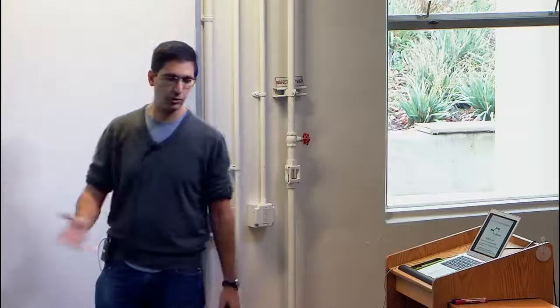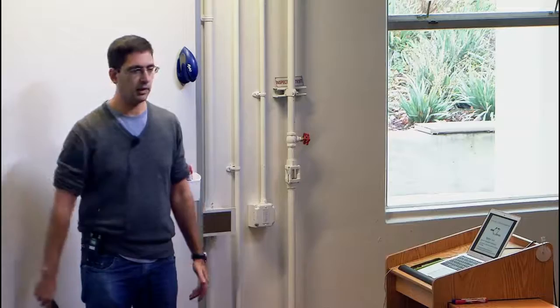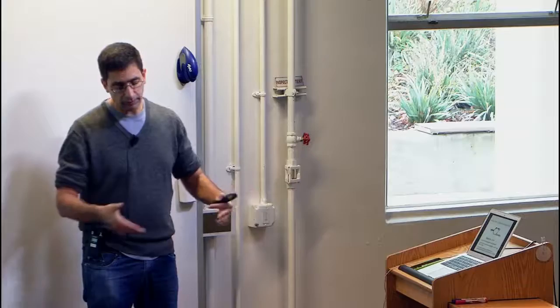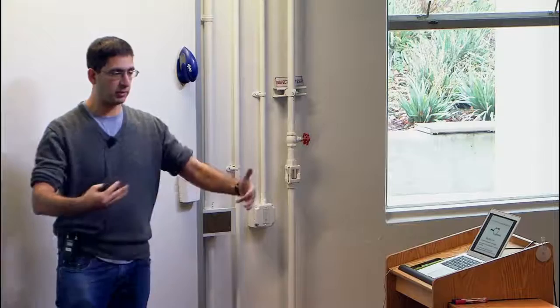You're missing stuff. The point of pseudo-alignment is that you can take the vast majority of your reads and assign them, leaving yourself a very small bucket with which to actually do the alignments and work, as I was telling you. I think that's the right way to go about things, because then you can spend a lot of time and really do assembly. We've actually done that. We have no publishable work yet, but we have all sorts of experiments. It's partly why we're building these graphs. We play with assemblers in our group, and we take the reads that don't align, assemble them, and see what comes out. I think that can totally help with the piRNAs you're looking at.